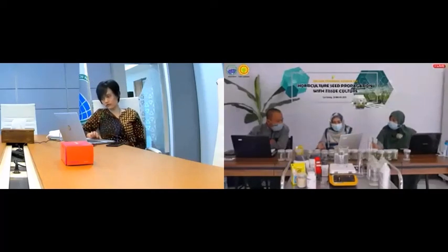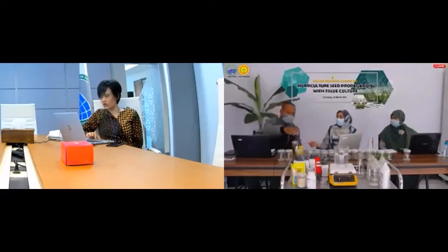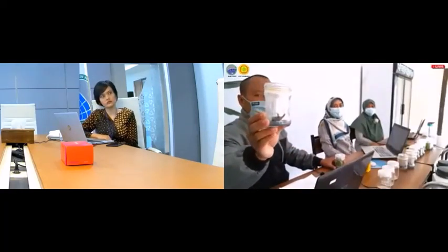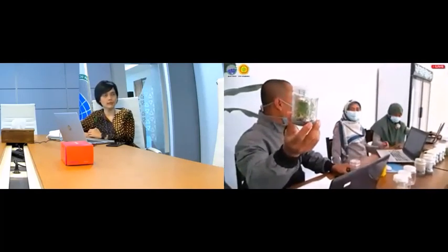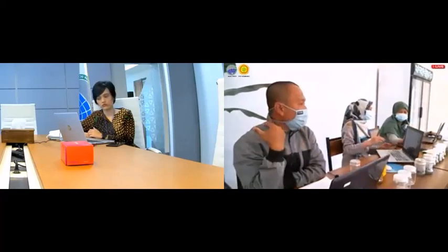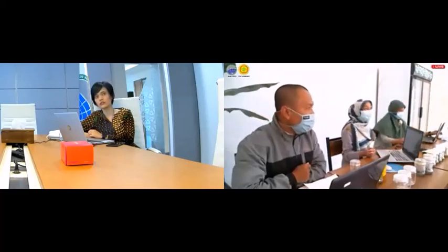Okay, please. How long is the explant banana sustainable before acclimatization? How long is this? Okay, this one, 1 month in the first step, and in the second step, the subculture step, 1 month, and after that you can do acclimatization. Maybe acclimatization is for the next topic, right, Mr. Abdul Rahim? Yes.